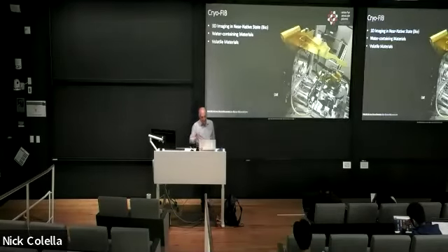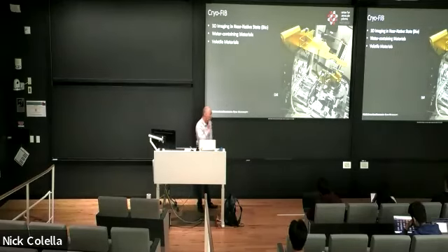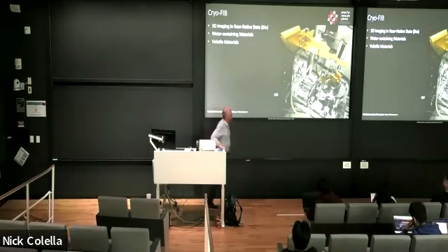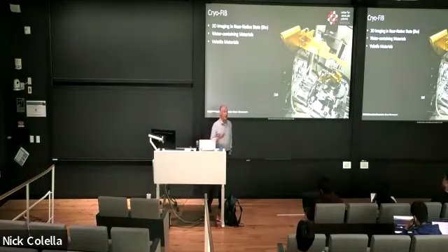So the next development that we are working on right now is to make it possible to work under cryogenic conditions, so that we can access materials that typically cannot be analyzed within the vacuum of an electron microscope.